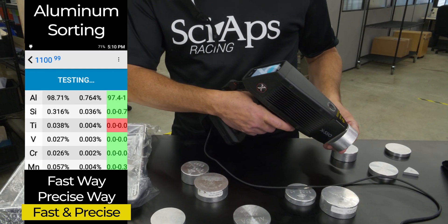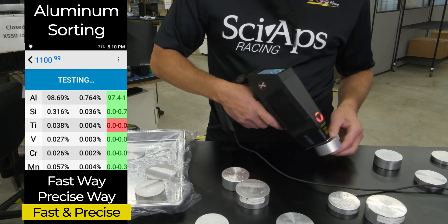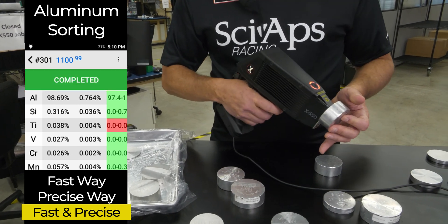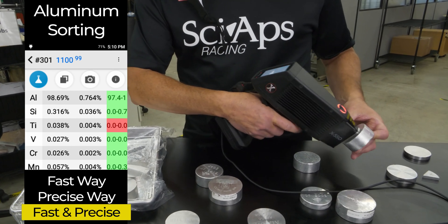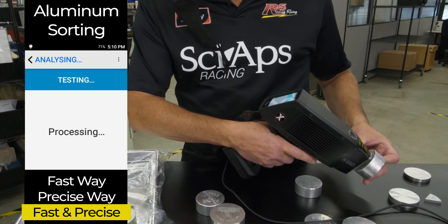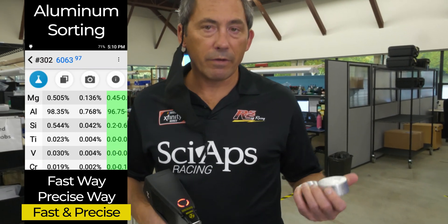That's a 1100 — you pull the trigger, two seconds, you're done, no magnesium. And that's the difference: half a percent magnesium, it's 6063; no mag, it's 1100. A couple of seconds — 6063, half percent mag, done. So a very fast way to sort those.